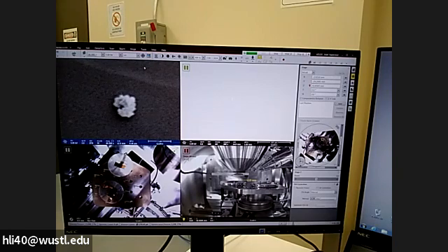So after you bring to focus, I also suggest user to use a link function. It's useful, especially if you want to fix working distance, which is consistent for if you want to do publication. Normally we use WD at 10 for this instrument. Now, if you look at the working distance here, it is 12.5.